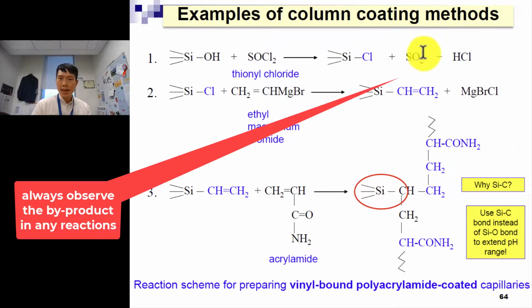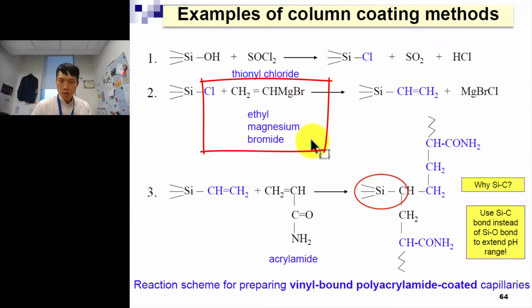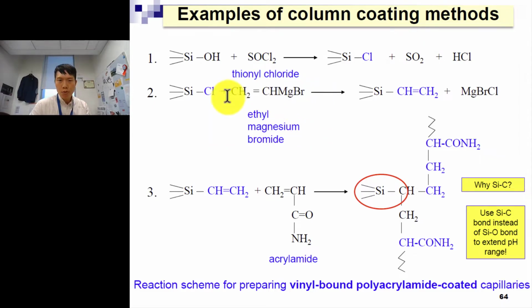So you've got to pay attention, do it inside the fume hood, make sure you don't breathe in these toxic gases. And after which, this is more organic chemistry, right? When you apply this ethyl magnesium bromide, a form of Grignard reagent, your RMgX, if you remember, then it will form a very strong Si-C bond here. They are very strong because of the same covalency in group 4, right? And with the release of this ionic salt here.